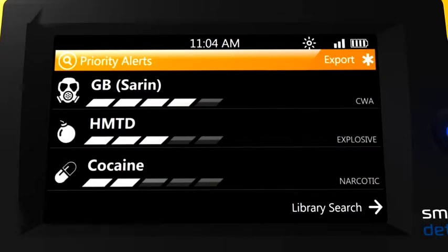The full chemical name is also shown along with a 5-segment scale depicting the level that each target may contribute to the overall signal. In a case where 5 bars appear, it is possible that the material was present in the sample in a nearly pure form and would likely be the only alert shown on the screen. A lower number of bars would indicate that the sample is probably a mixture, perhaps of chemical agents mixed with contaminants, homemade explosives, or narcotics mixed with cutting agents.